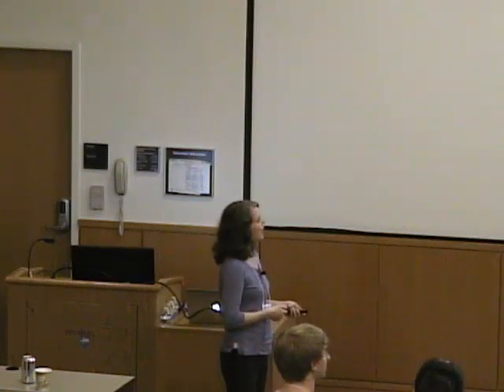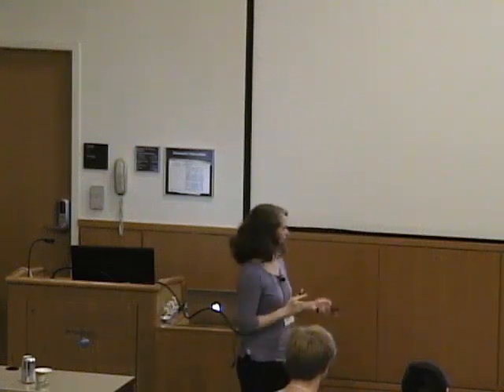So you all learned in organic chemistry and have used in your own work, I'm sure, thinking about chemical shifts, using that to assign ligands and other compounds. And so you're all familiar with the concepts of shielding and deshielding and what kind of chemical shifts you normally get in your molecules. So I want you to erase your brain of all of those ideas, because we are not going to be talking about shielding and deshielding and electron density at all. The factors that determine chemical shifts in paramagnetic molecules are completely different. All right, so don't even think about that.